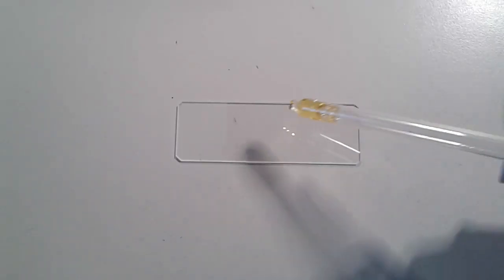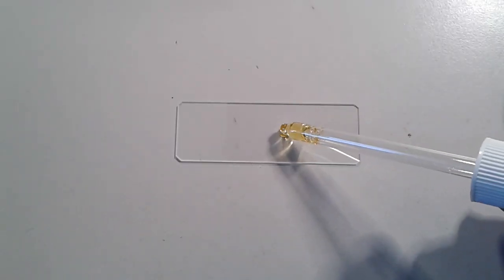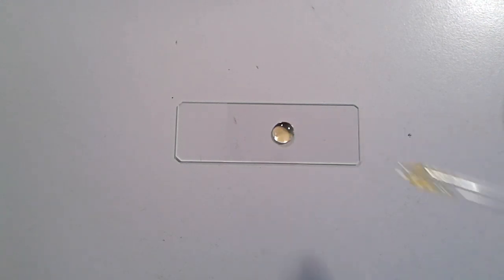The question is: what do you do with them? Well — do I have to say more? I put them on the slide and right now I'm putting a drop of Euparal mounting medium on the slide.